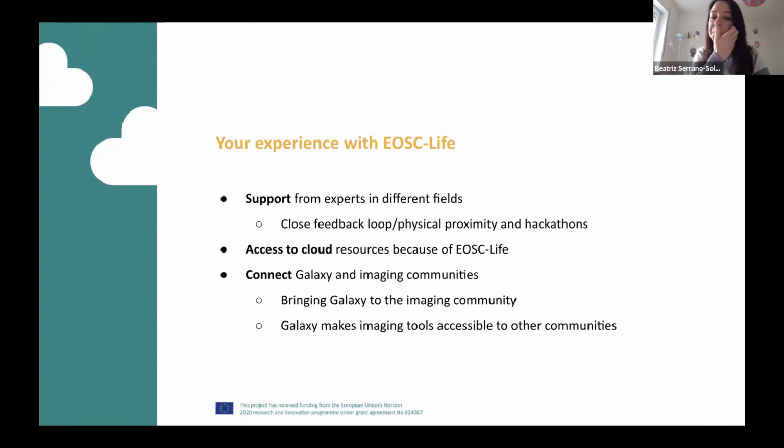We also think that this project could have been done in collaboration with the IDR and run everything in the EMBL cluster, but we wouldn't have had access to the cloud resources if it weren't for EOSC-Life. So that's something that I think is adding value to this project. And then the other thing I briefly mentioned already, how we are connecting Galaxy and the imaging community, and that would work in both directions. On one side, we are bringing Galaxy to the imaging community, so the imaging people can combine this with other tools for analysis. But at the same time, Galaxy is making these imaging tools accessible to other communities that might need them.